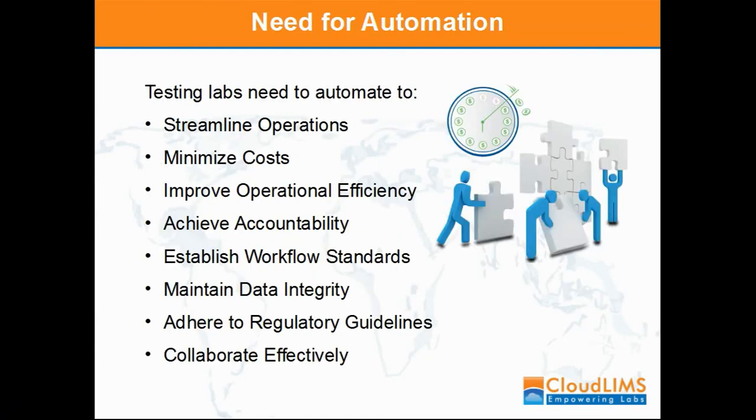With advances in technology, there is an increase in data volumes and sample throughput. The testing lab will in turn seek to streamline their operations and cut costs by modernizing their laboratory management approach. This would help them to efficiently manage, track, and centralize their data. An automated lab reduces the risk of human error and allows personnel to be deployed for core lab jobs, thereby saving time and money, in addition to improving work efficiency.